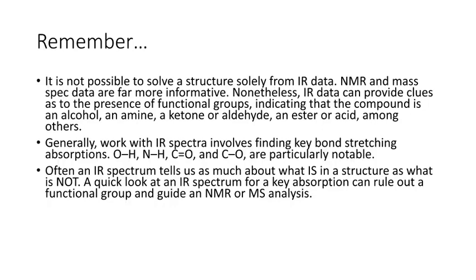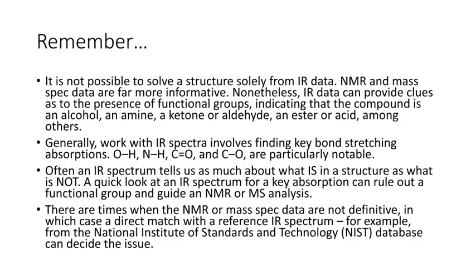That sort of thing. And there are times when the NMR or mass spec data are not definitive, in which case a direct match with a reference IR spectrum, for example, from the National Institute of Standards and Technology, NIST, database, can decide the issue.